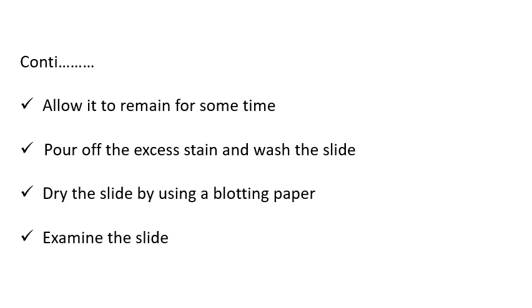After applying the stain, you have to allow it to remain for some time, according to the stain you are using. After that particular time, pour off the excess stain and wash the slide.